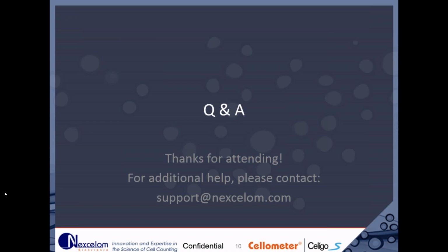Great. Another question: why integrated intensity and not mean intensity, considering all the cells are the same? I kind of figured that's normalized that way. So some cells have more pixel intensity than others. When you use mean, it's actually dividing it by the number of pixels within the graphic overlay.